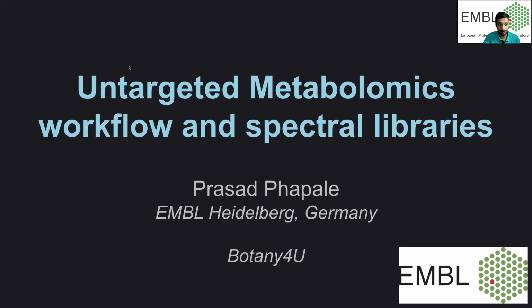And I would like to give you insights about metabolomics and lipidomics and more technical aspects of these omics: how to perform the experiment, how the workflows are run, and how you can do the data analysis. I hope that it will help you in your own research in botany or animal science, anywhere.